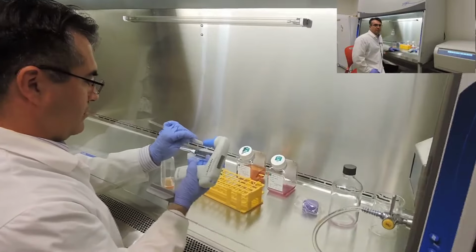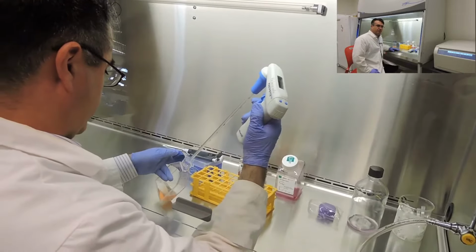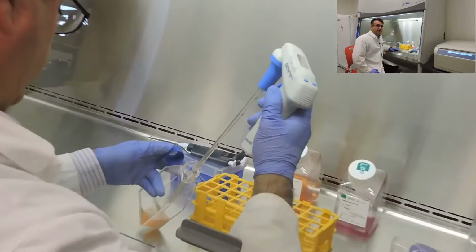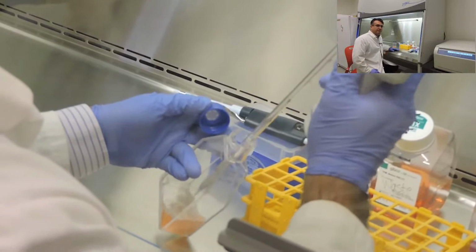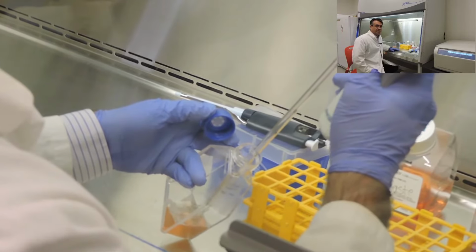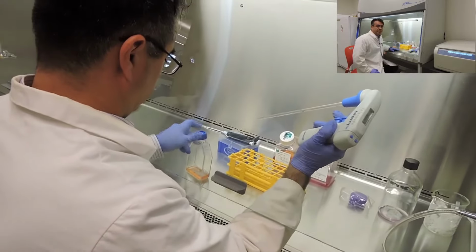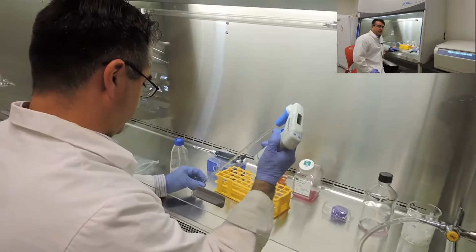We're now in the tissue culture room. In this room, we grow and treat our cells with different natural compounds, such as curcumin and resveratrol. The cells are handled in sterile conditions and then kept in an incubator for growth. So right now, what I'm doing is cleaning the cells and taking a small sample so that I can count the cells and calculate not only the growth rate, but also the viability of the cells and determine if the cells are dying from the treatment or if they're living longer.